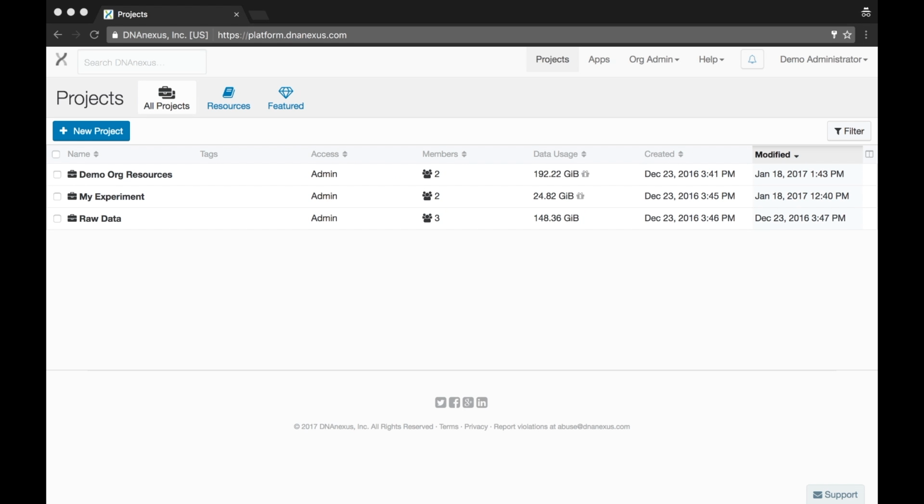The process of creating a new user is similar to adding a user to the org. We won't go through the details of all the org member access here. For more information about org member access, please see the links below.